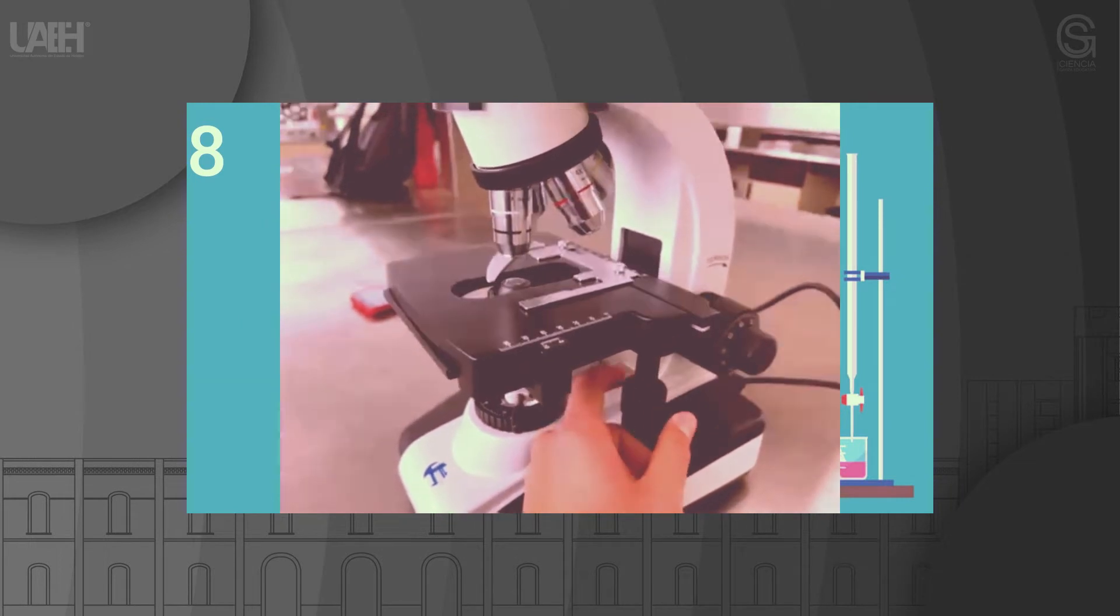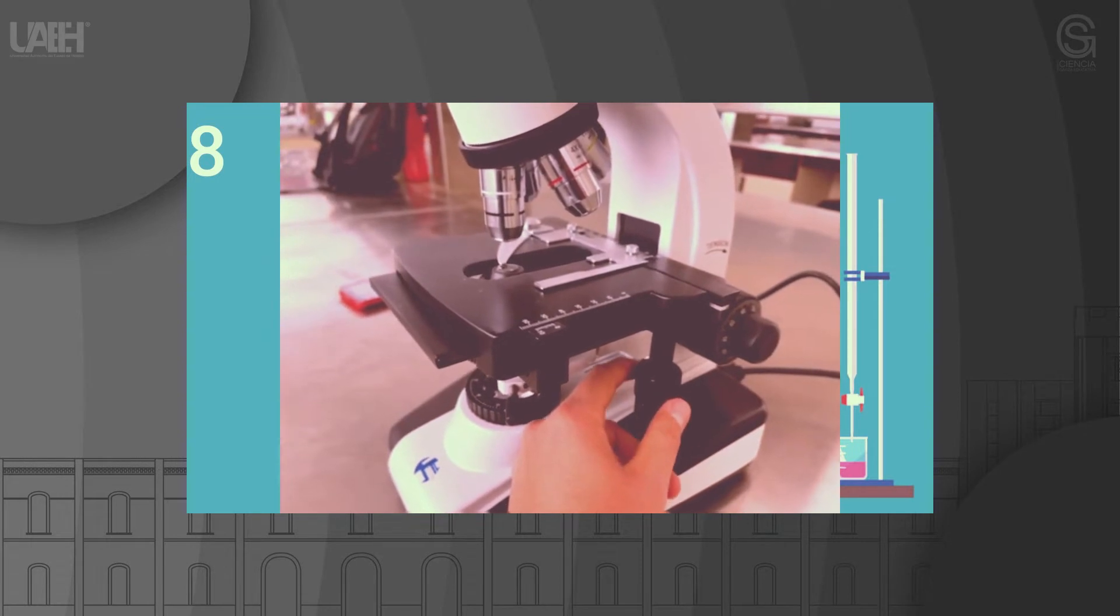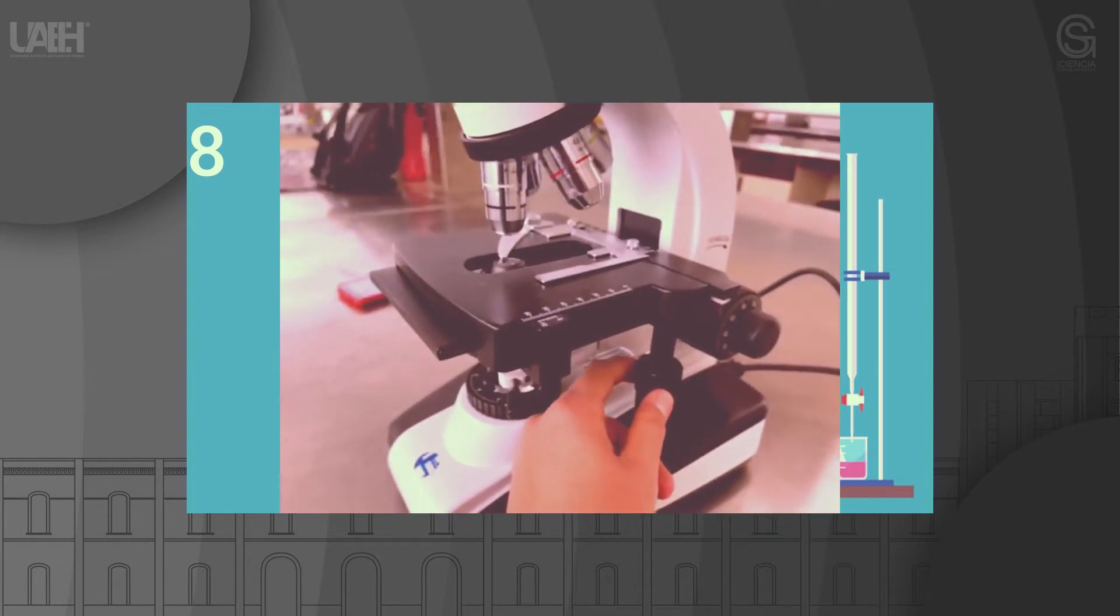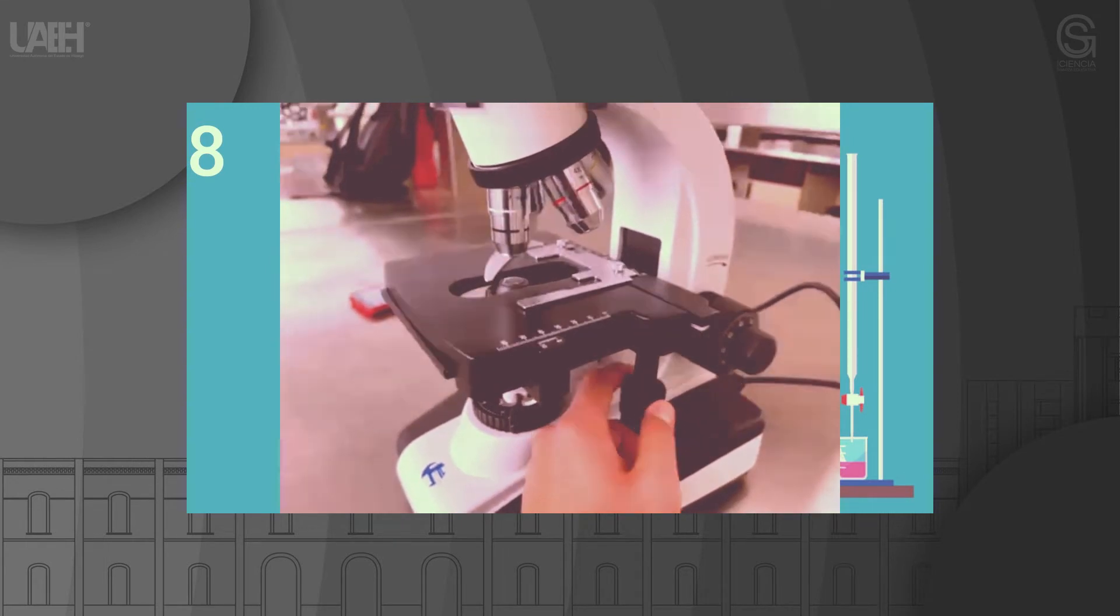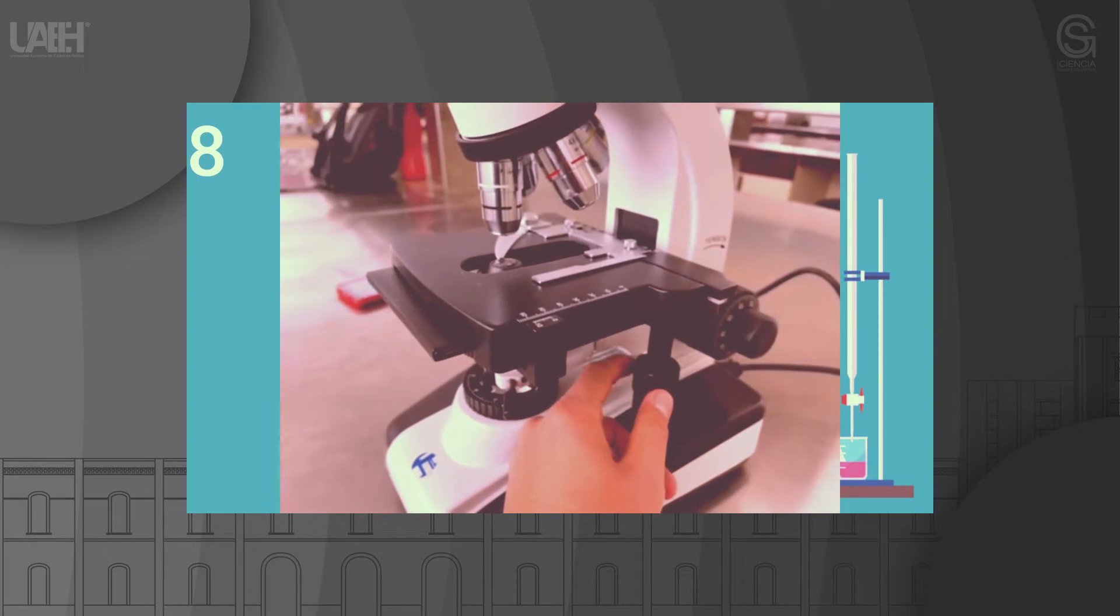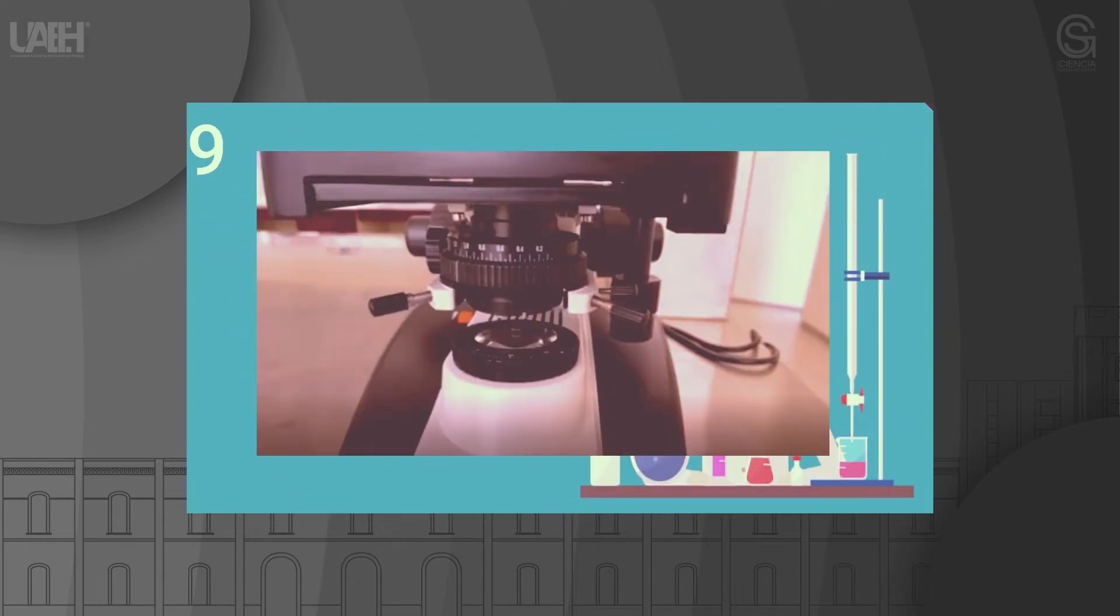Step 8: Once you can see a focused image of the sample through the eyepiece, carefully move the slide so that the details of the sample you are interested in come into your field of view. If your microscope is equipped with a moving carriage, you can use the moving carriage screws to adjust the position of the slide.